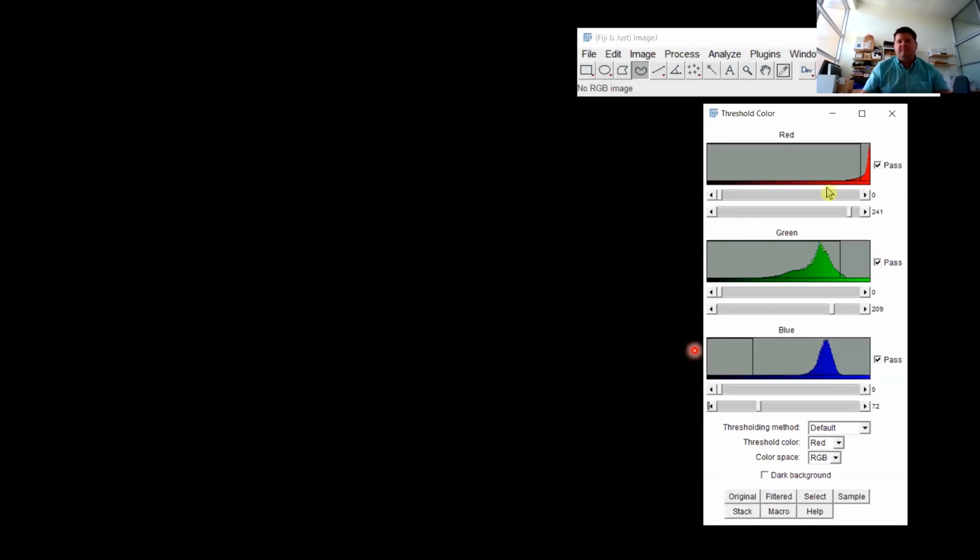And what's nice is you can actually get the macro command and then feed that in to do it on all your images, which will be the third workshop on advanced topics that we'll cover. But you can get selections from that. You can use it for bright field as well. It's a bit more tricky. Like if you just have phase contrast images and you want to select the cells, there are other methods that you can use and employ for that. So come and talk to me if you have questions on that kind of space.